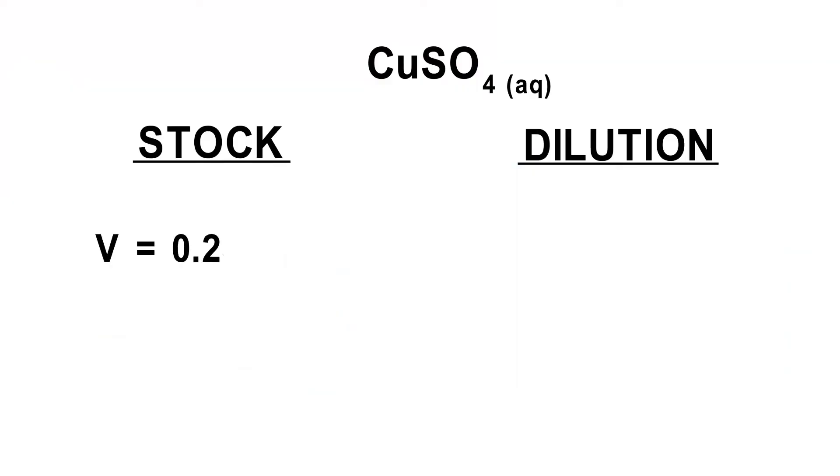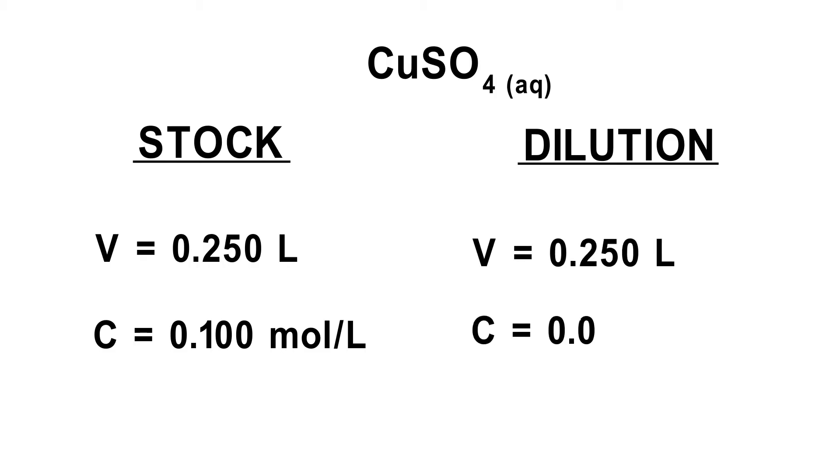For this demonstration, we will prepare 0.250 liters of a 0.100 molar copper(II) sulfate stock solution. We will then dilute the stock solution to prepare 0.250 liter of a 0.004 molar solution.